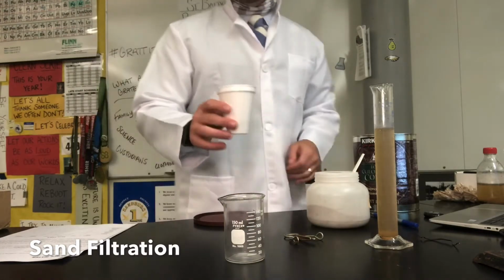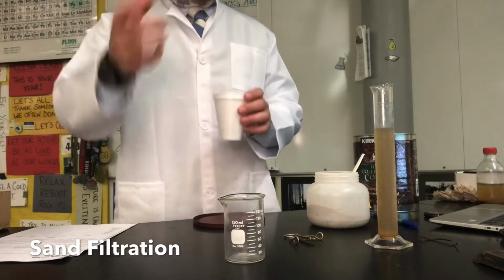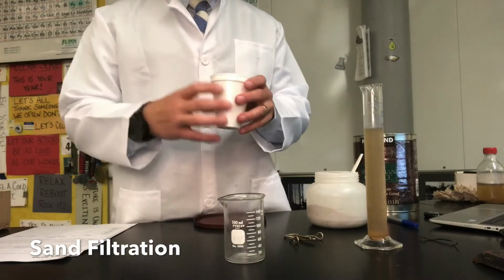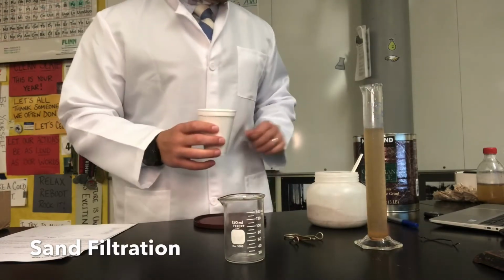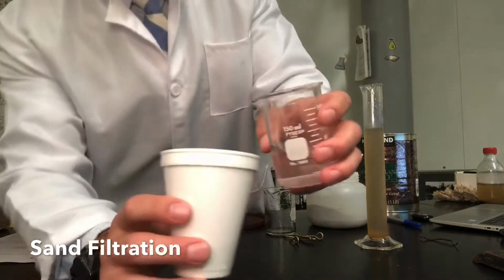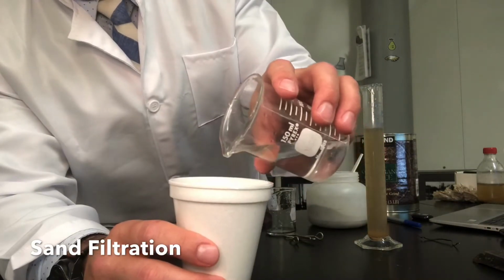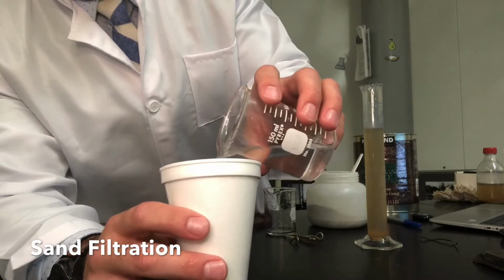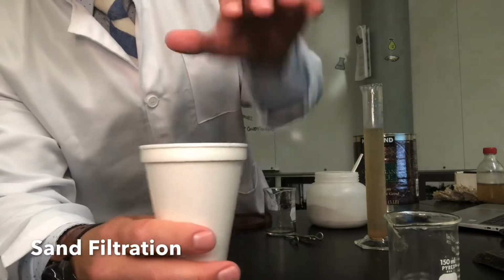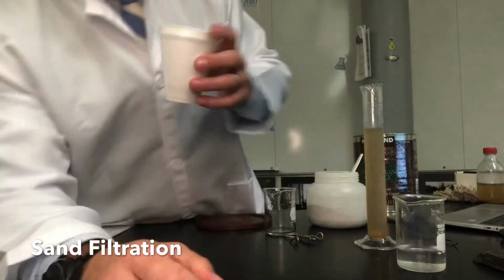I'm then also going to get a little bit of water to moisten it so that this sticks together, so that when we pour our water sample through, we won't get all that liquid just stuck to the sand. So give me one moment. Let's take a little bit of water and we're just going to wet the sand just a little bit. There we go. By just making it a little bit wet, it's going to be more likely that we'll let the water that we are using run through. Okay, so it just has a little moisture in there.